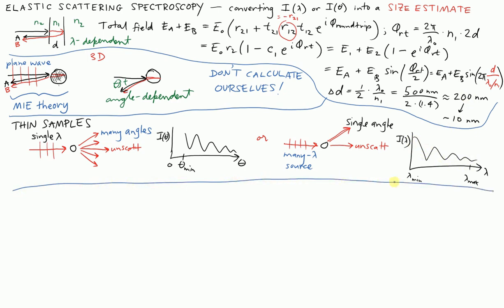The really important thing for biomedical optics is that we're often not presented with a thin sample. This stuff is good if you have a cell or a cell monolayer on a microscope slide. But what if you want to measure a tissue? What if you have an intact bulk tissue? So you now have thick samples.